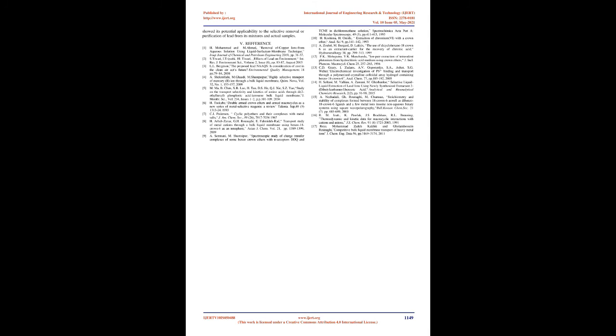Back extraction efficiency was evaluated, and it was found that for 2 measured samples, Bokovici and Berkovica, all amounts of Pb(2) ions were stripped from the organic solution, dichloromethane, into the aqueous phase. More than 94% of Pb(2) ions were stripped from the sample Debitac, while the lowest removal efficiency, 50%, was shown by the measured sample marked as Suljagic.